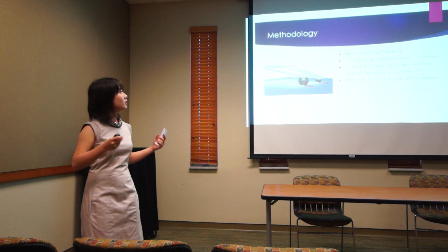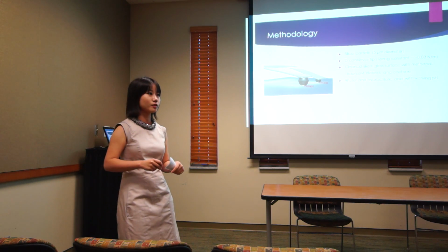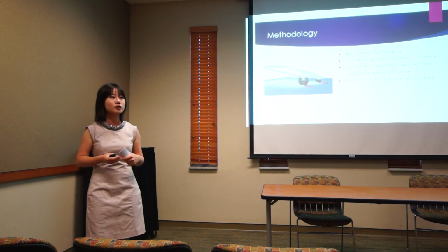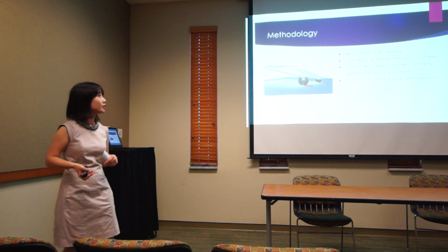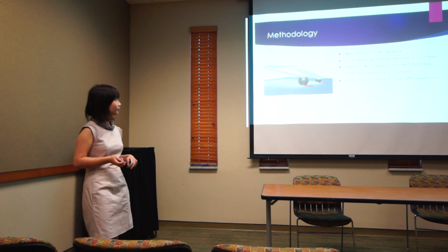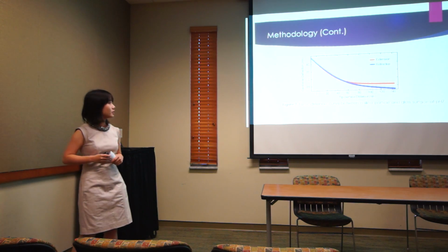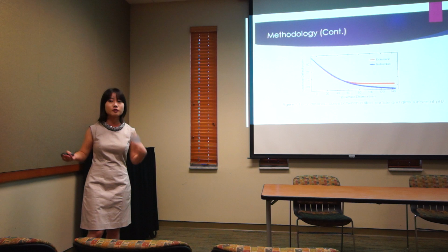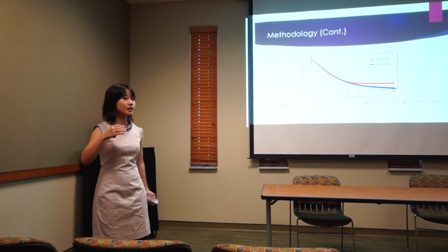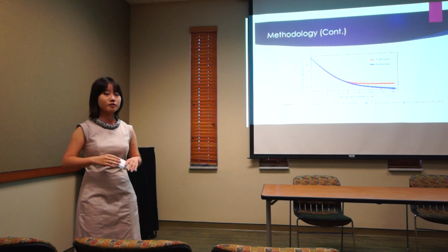Then we insert the cantilever and glass surface into the atomic force microscope, and then we take a force measurement. The solution we are using is made of water and hydrochloric acid with controlled pH. So after we have set up our experiment, we're ready to measure the force curve. We need to start several hundred nanometers above the surface and slowly approach the glass surface.